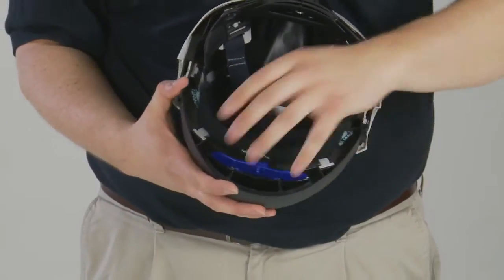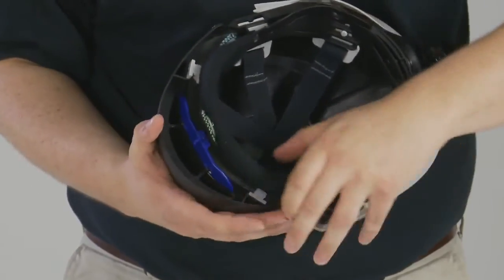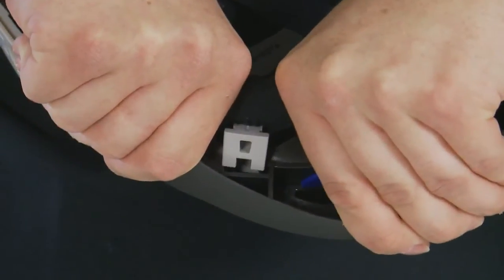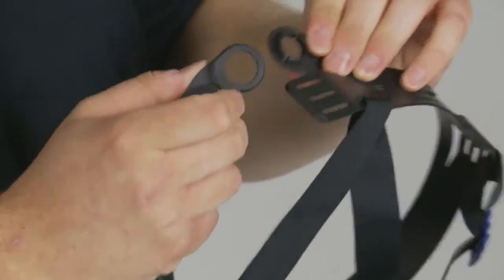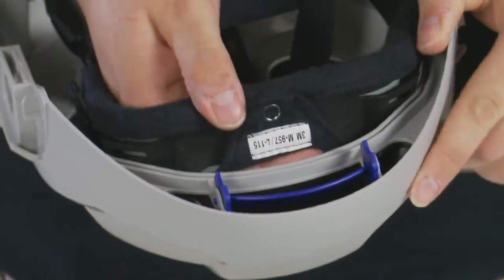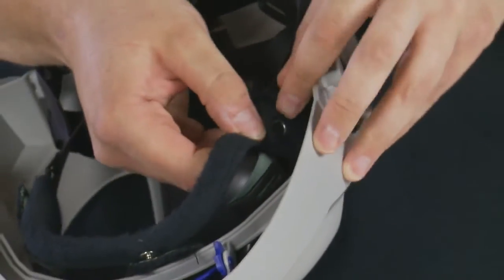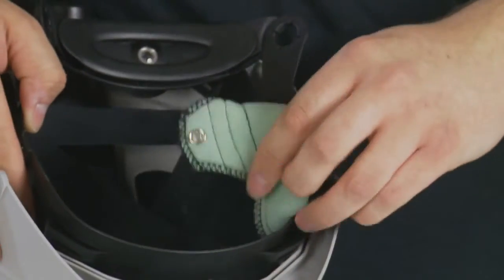The head suspension for the M300 and M400 series can be removed as a complete assembly by pushing upwards on all four plastic hangers for the cradle. The ratchet assembly can be removed from the headband for easy and independent replacement. The forehead pad can be removed and replaced by releasing the three press studs that hold it in place. The press studs are located in the centre of the forehead and one on each end.